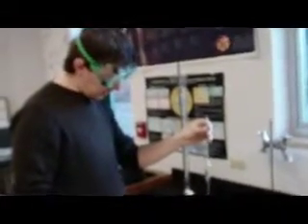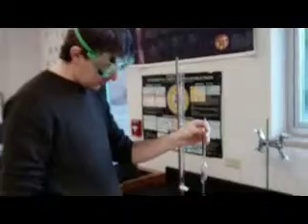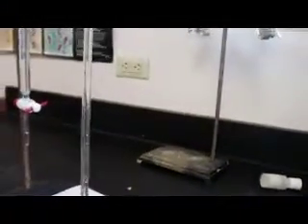And when it gets all the way done, you simply touch the tip to the liquid in the bottom. There's going to be a little bit left in there, but that's okay. These have been calibrated to have that little bit left in there, because that little bit is the same every time. So just let it run out. Again, touch the tip to the liquid, and you're done. You've just dispensed exactly 20 milliliters.